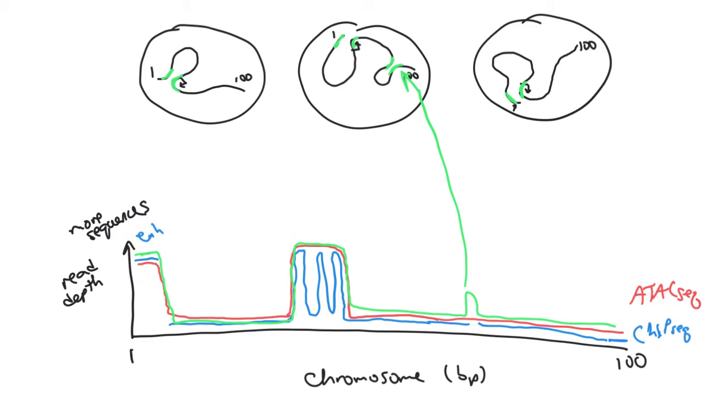So in closing, we will expect that where there's a transcription start site and a complementary or coding DNA sequence, a CDS, the coding region, we will definitely expect to see euchromatin. So that will be peaks for ChIP-seq and ATAC-seq. And what we'll see is there will be regions of the genome that aren't known to have a gene.